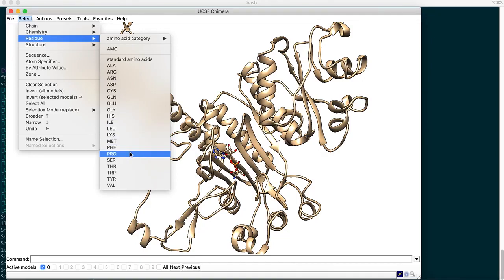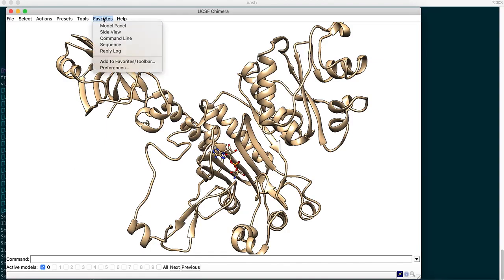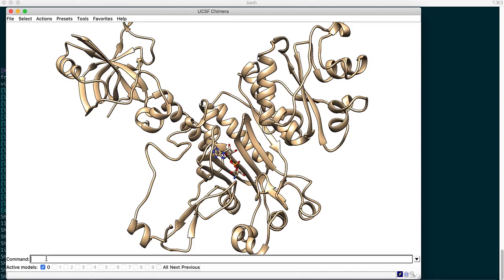We cannot pinpoint residues by their number through that menu alone. To do that we'll use the command line interface - it's a very easy, user-friendly language. To access it, go to Favorites and you'll find the Command Line Interface as the third option. Click on it and a command box will appear. We want to highlight specific residues involved in the binding site or active site domain.